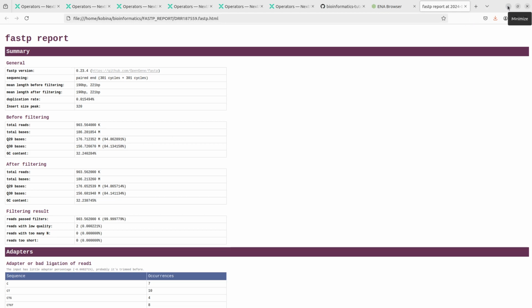All right, so you can just check and then see. Congrats for using Nextflow. And the beauty of Nextflow is that we had 3 samples, and Nextflow automatically analyzed all those samples for us. We had fastp trimming or filtering all the samples for us. We didn't have to write a loop or anything like that. So Nextflow helps us to automate our pipelines. It also makes it scalable, reproducible, and all that stuff.